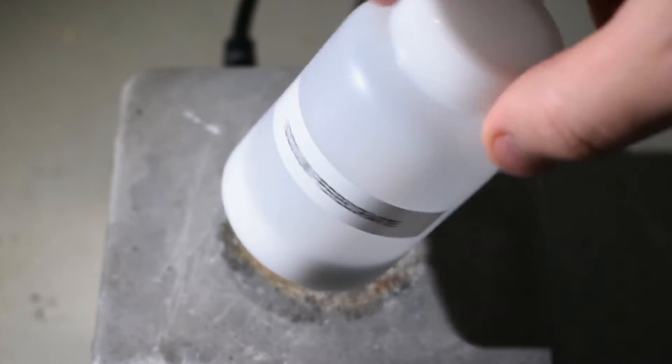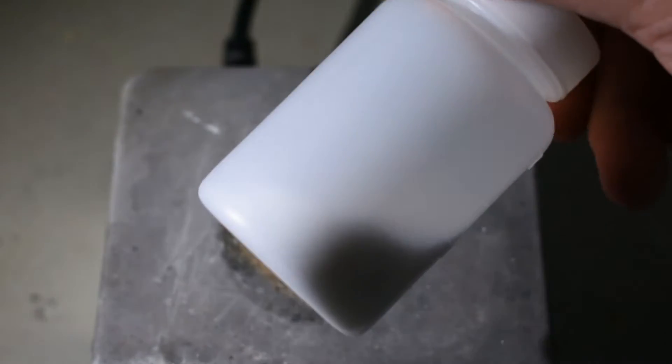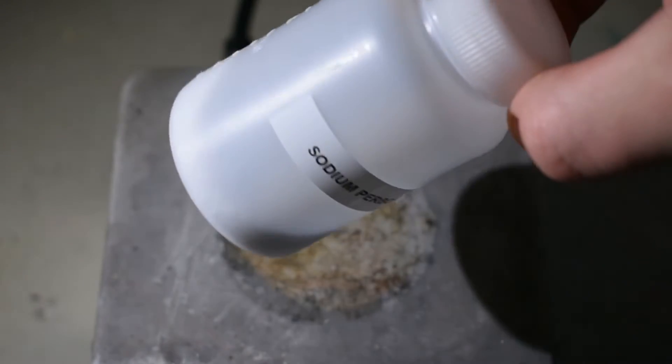Okay, here's the sodium perborate I got. It is roughly 20 grams of a white free-flowing crystalline powder.